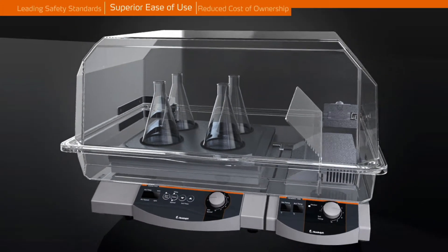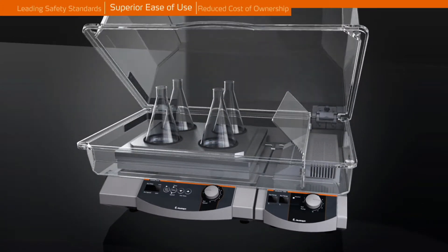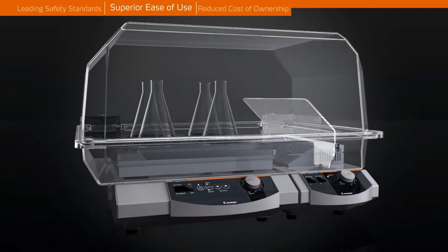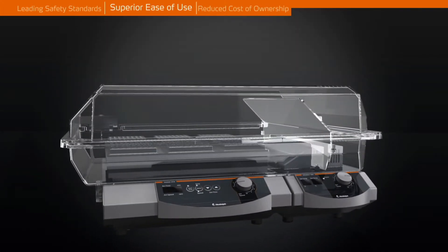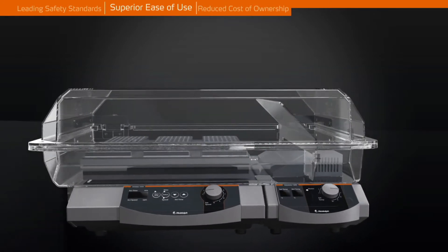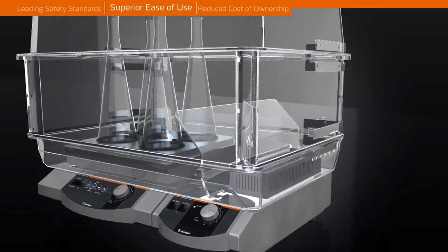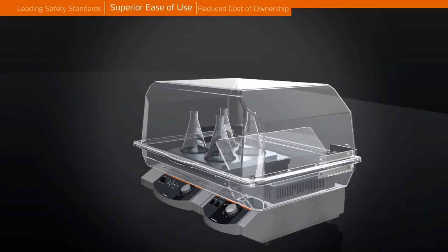An optional incubator hood opens instantly and interlocks in any position, allowing immediate access. No matter how large your vessels are, three incubator hood sizes are available that can accommodate even 2.0L Erlenmeyer flasks.